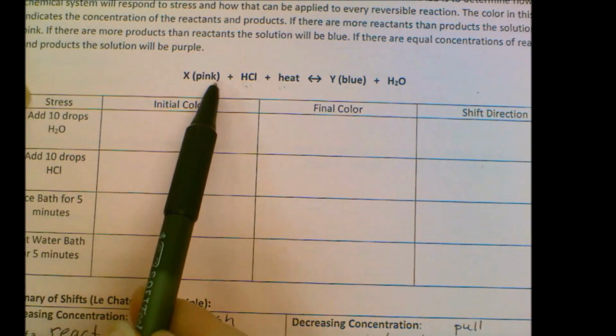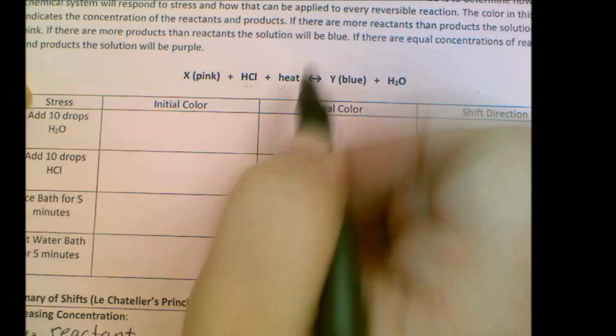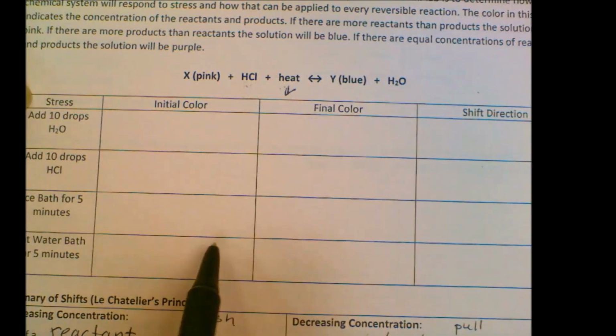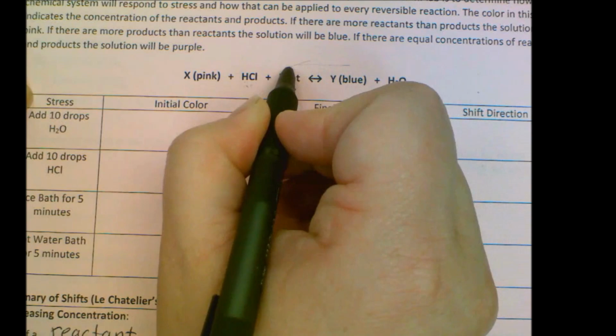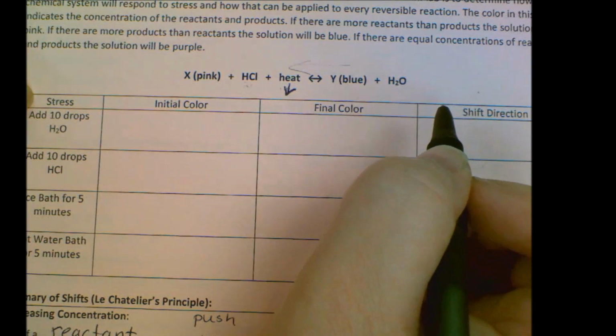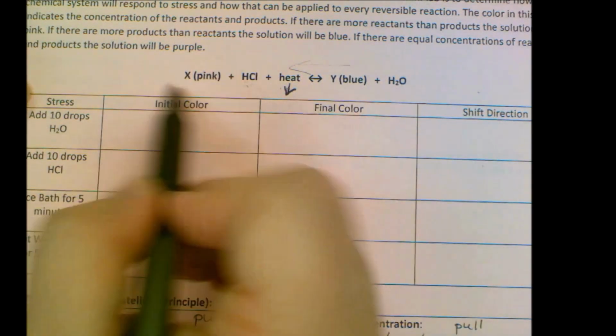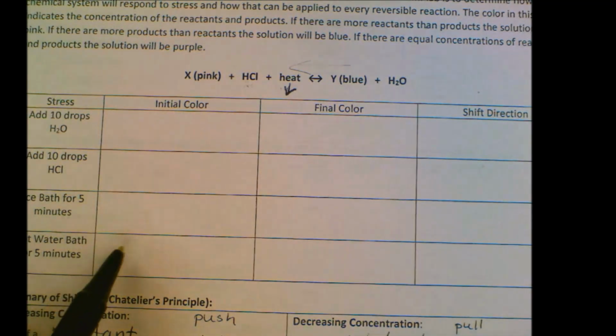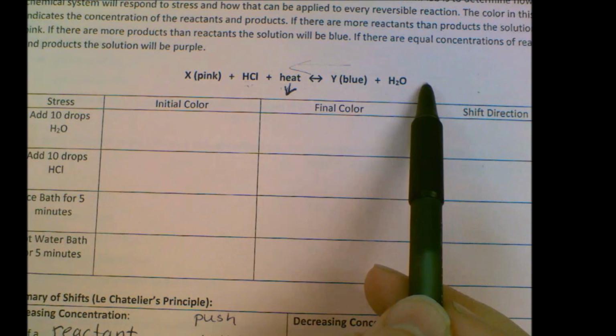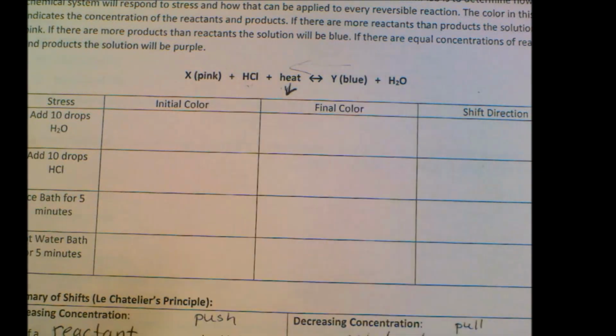So if you look at our reaction, we took away heat. We reduced this amount of heat. It went down, so we have to get it back. So it shifted towards the pink side, and we got more pink, but it also replaced that extra energy that we needed, that heat. So these chemicals reacted, we got more of the chemicals on the left.